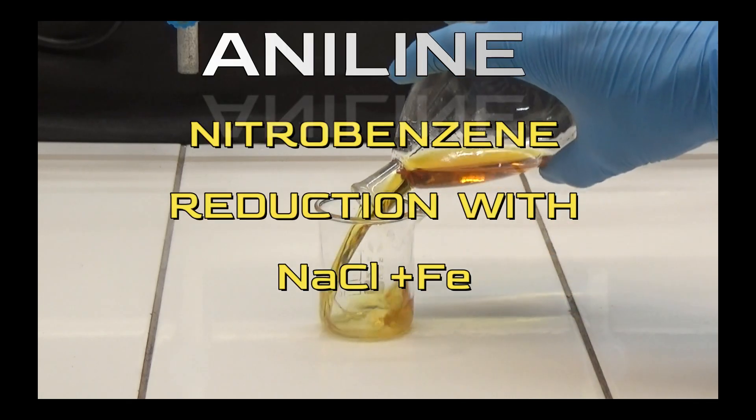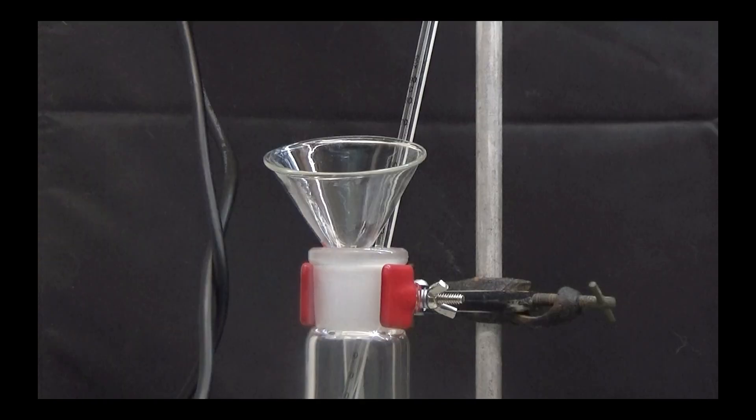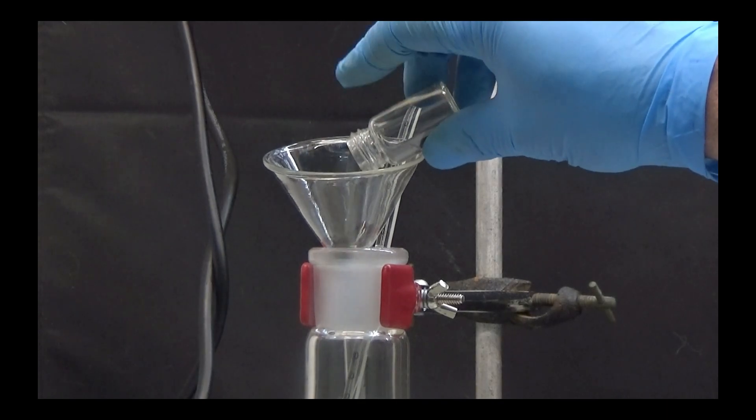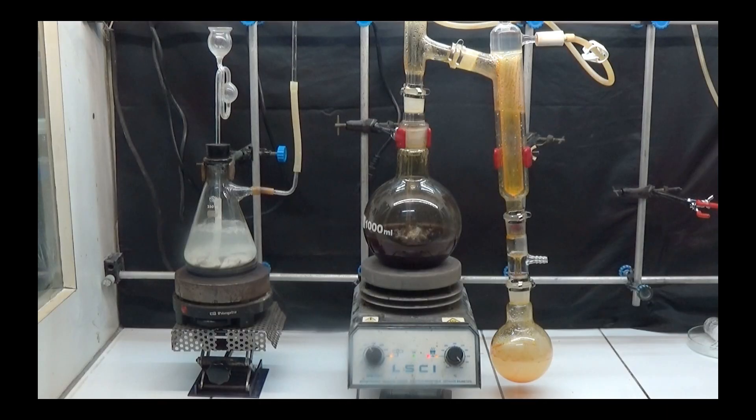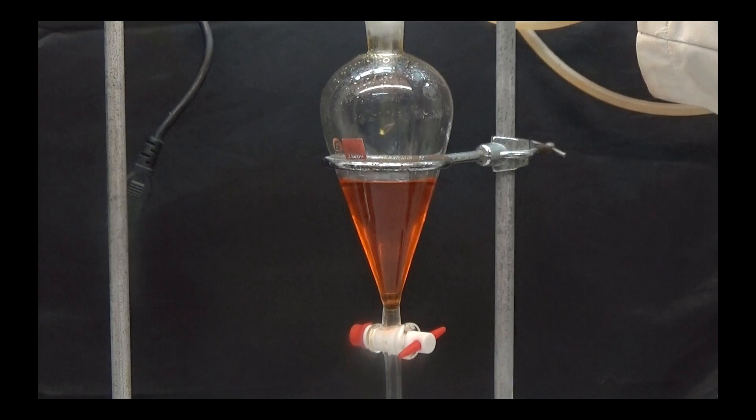In this video we will obtain aniline by reducing nitrobenzene with sodium chloride and iron powder, separate it with steam distillation, and purify it by converting it into its hydrochloride.